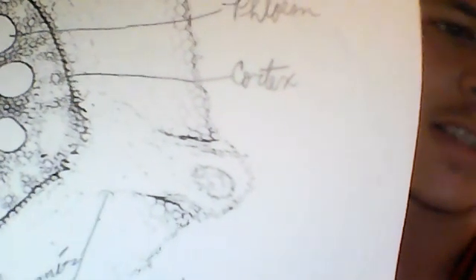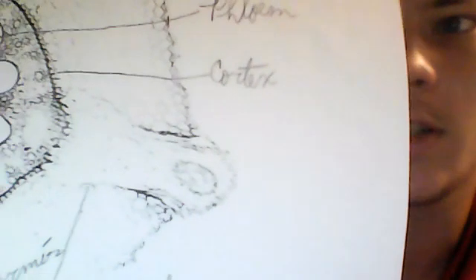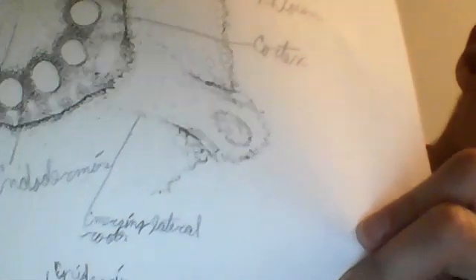Then you got the cortex, right here. And this is if you cut the root going up. Then you got the emerging lateral roots, which are right here. You see, as the root's coming out.